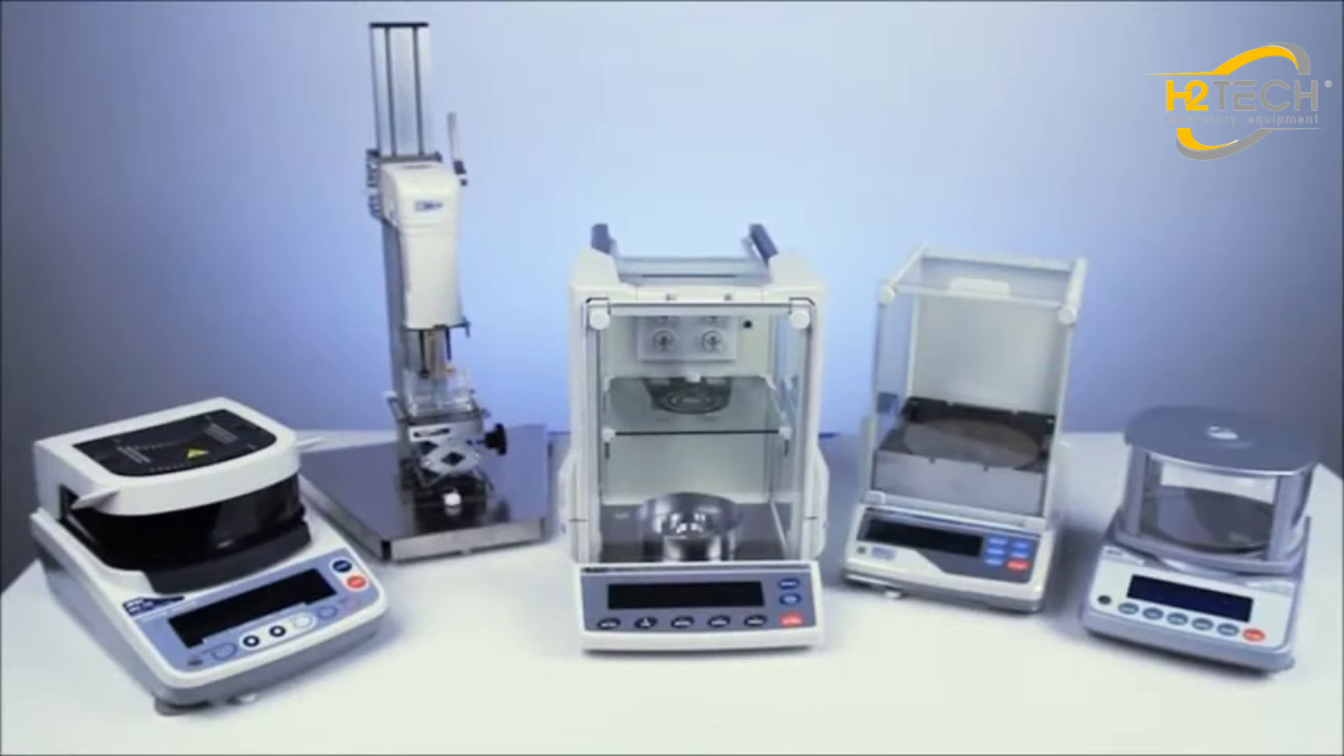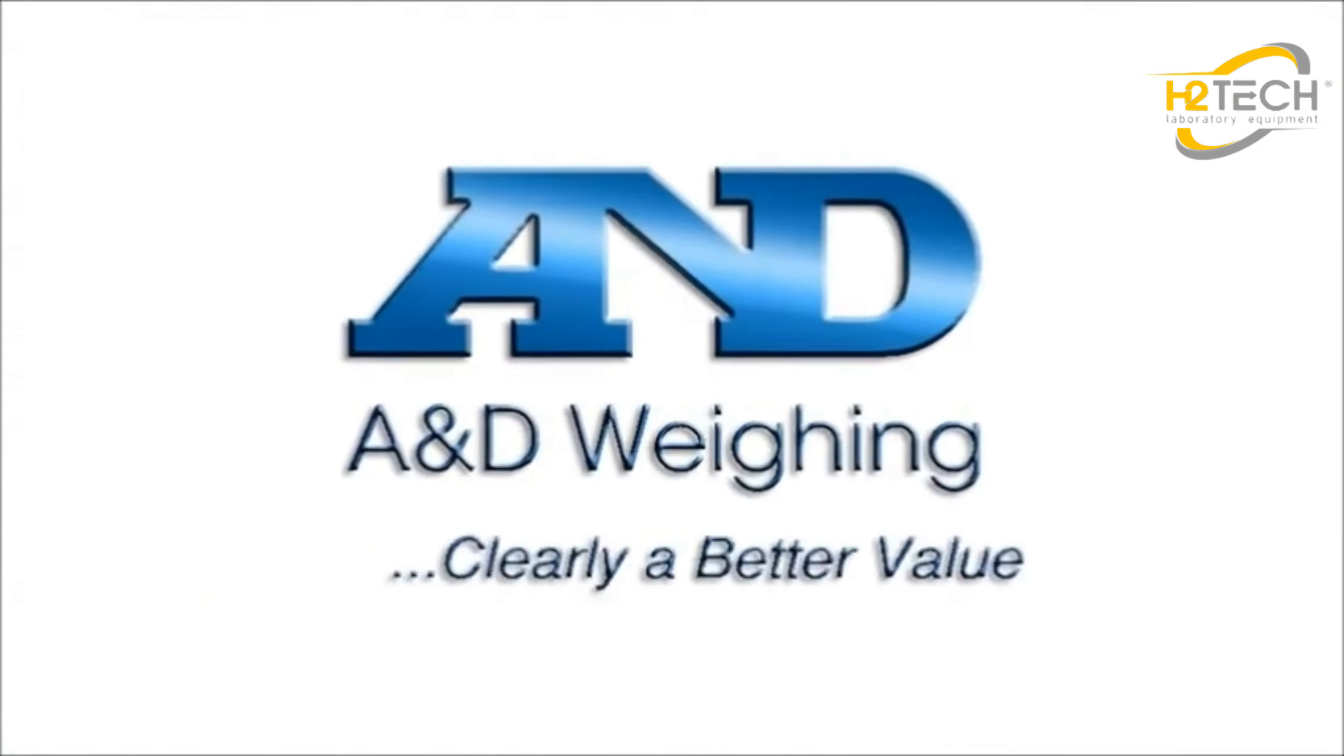Moisture Analyzers, Viscometers, Laboratory Balances, and Scales from A&D. A&D, clearly of better value.